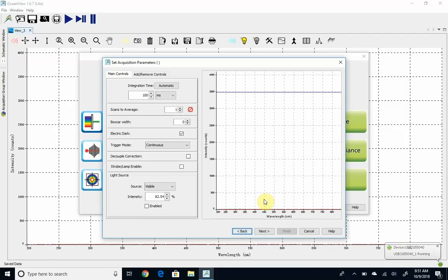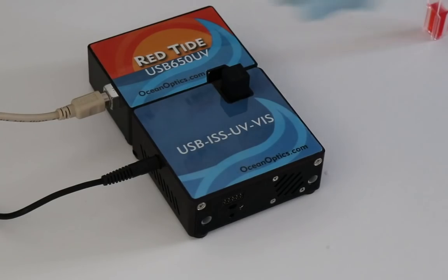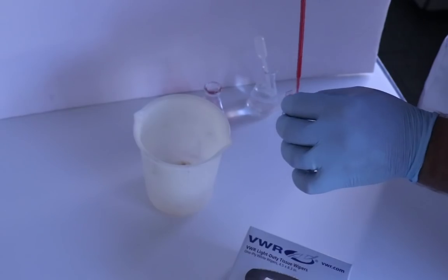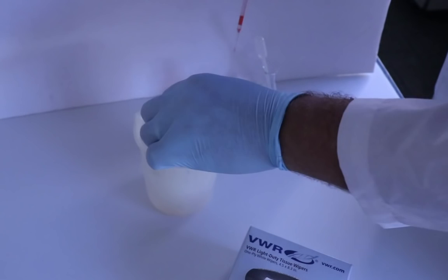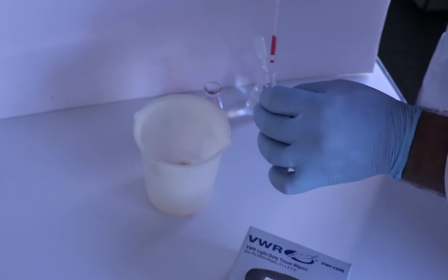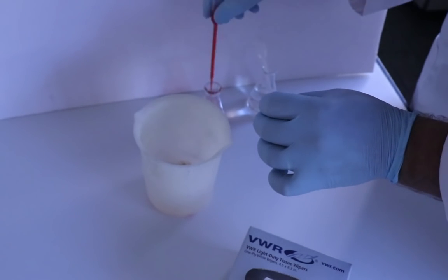This first step is going to be to set the integration time. We're going to take out the black plastic plug, and you're going to put in one of your samples. The darkest sample is going to be the best one.